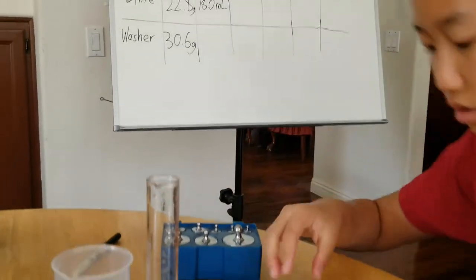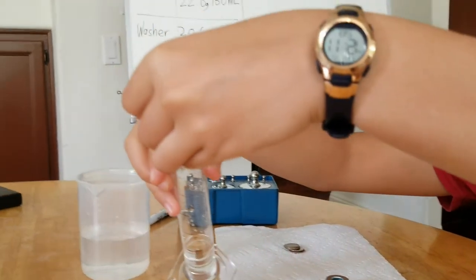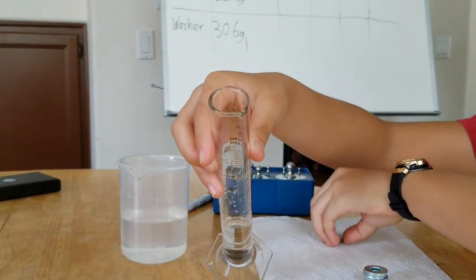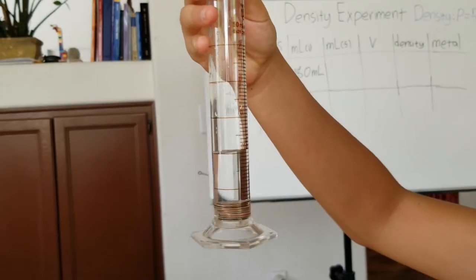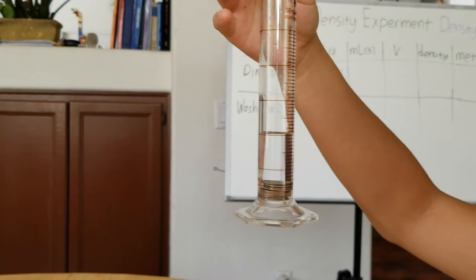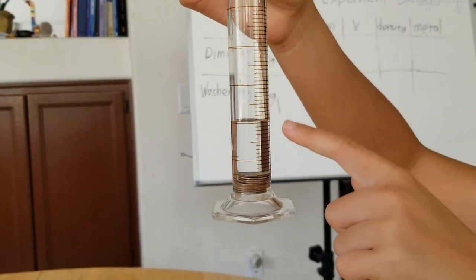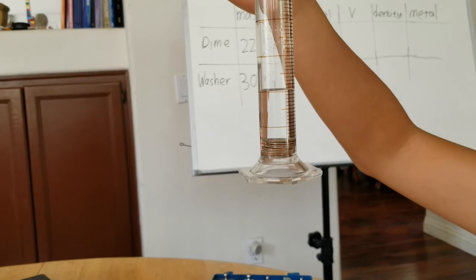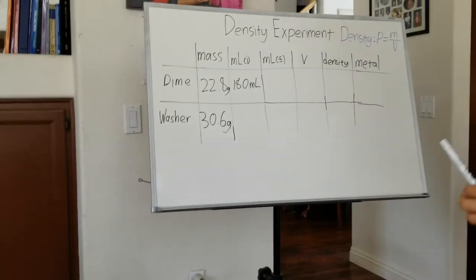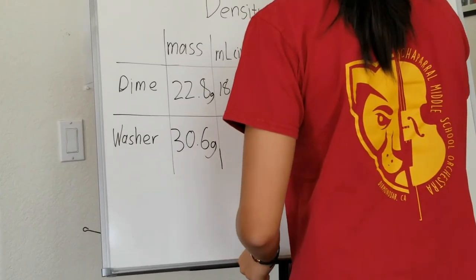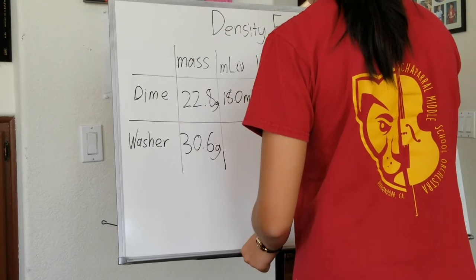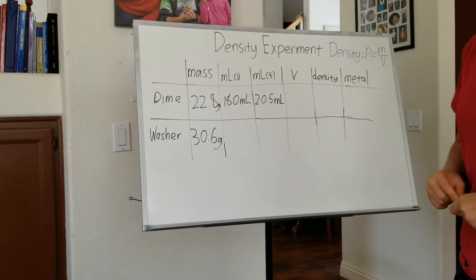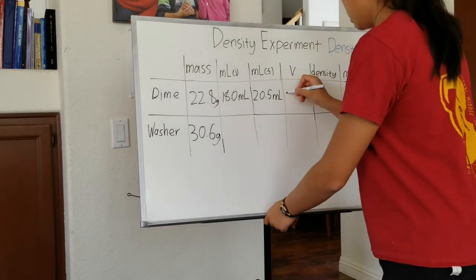So our initial volume in milliliters would be 18.0 milliliters. The I stands for initial, the F stands for final because to find the volume in the end, you're going to need to subtract the initial volume from the final volume. Now, take the dimes and you can slide them slowly into the water so that it doesn't make a huge splash. You can twirl it a little once again to get the air bubbles out, and you would look at the curve, the lowest point of the curve. So this is at 20.5. So on here I would write 20.5 milliliters. Now all you need to do is subtract 20.5 minus 18 to get the volume.